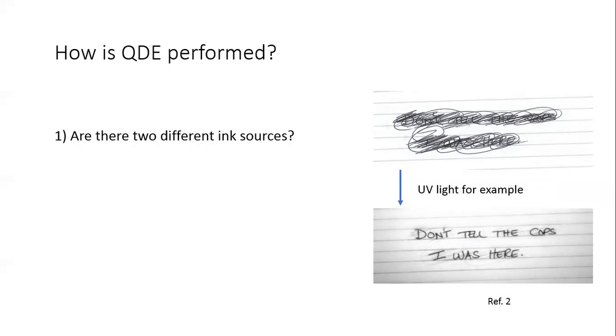Different inks respond differently to various light sources and light wavelengths. So to identify if some text was altered with a different ink, the sample is exposed to radiation filtered at various wavelengths using a piece of equipment called a video spectral comparator. And you can see the principle and the results of its work in the picture.